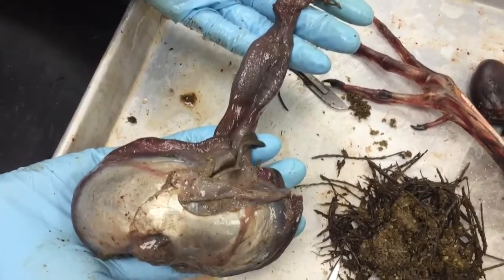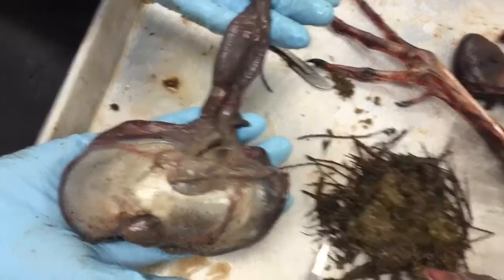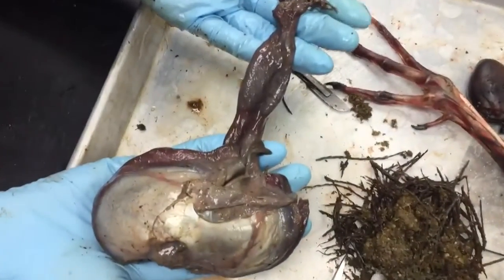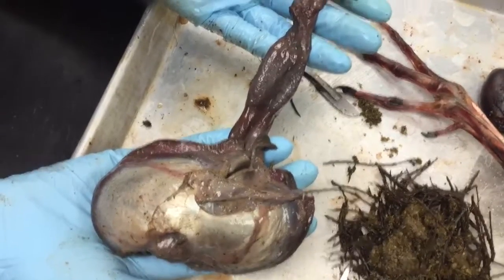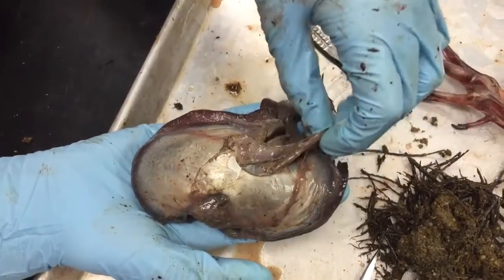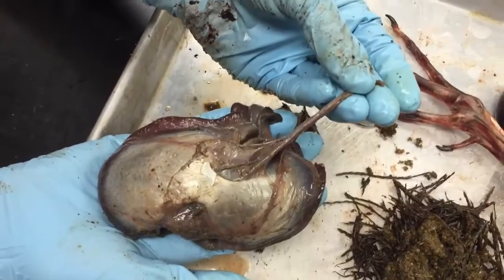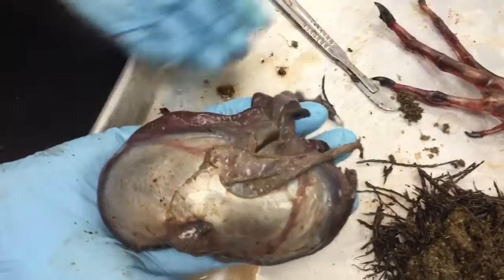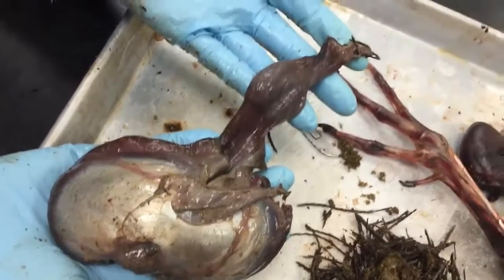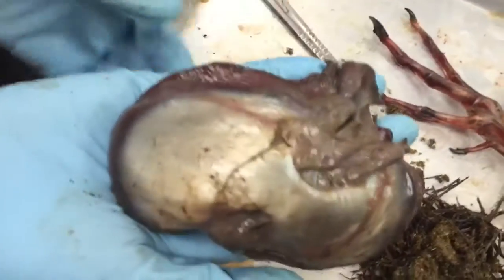Here we have a stomach — basically the ventriculus of a Canada goose, and there's the rest of the Canada goose right there. Emily, can you pull up the outflow portion? So that's the pyloric portion right there — that's the outflow part. And how about the inflow part, the glandular part, the proventriculus and the esophagus? She's actually opened it up and slid it open.